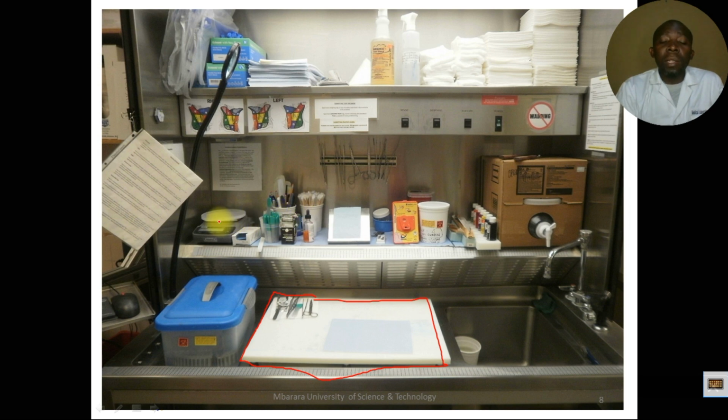We have the weighing scale here, because we may need to measure the weight of the tissue. We have ink. Where I'm putting the mark with my pointer, that is ink. We have gloves. So this is a grossing station which is well equipped.